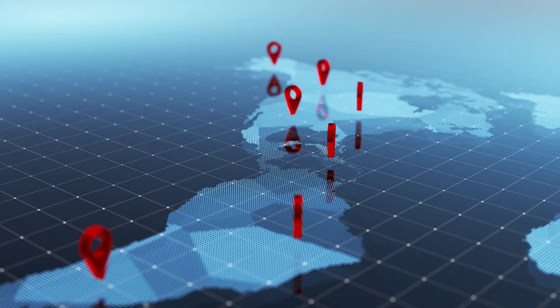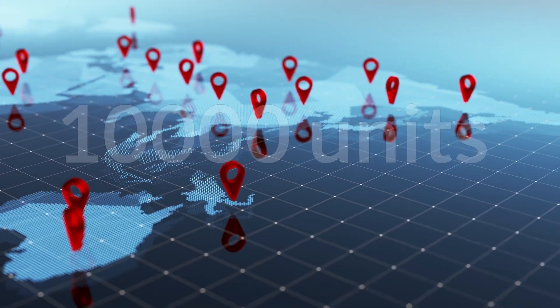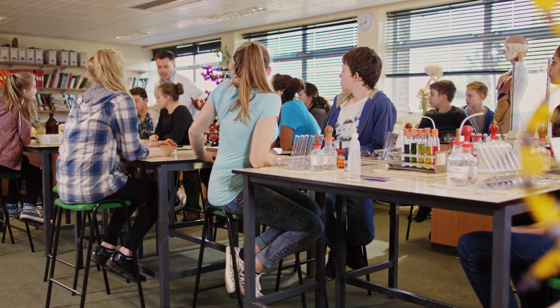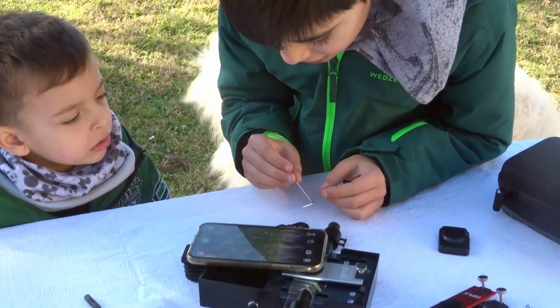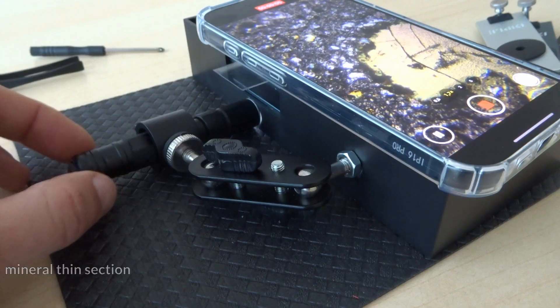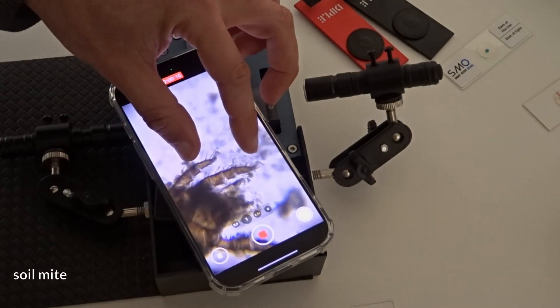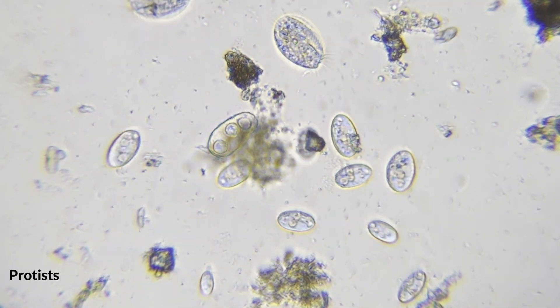After the first successful campaign of Dipple, we shipped more than 10,000 units around the world — for research work in university labs, for teaching science in schools, colleges, and universities, or just for fun at any age. Dipple 2 is for biology, mineral science, plant biology, marine biology, soil study, numismatic, or everything you want to observe at the microscopic scale.